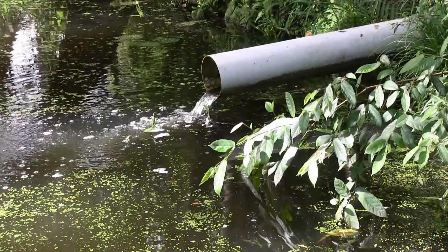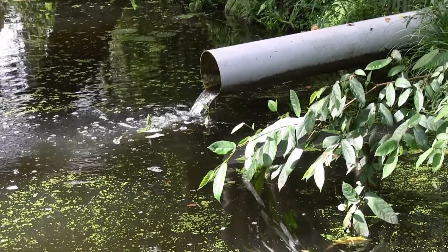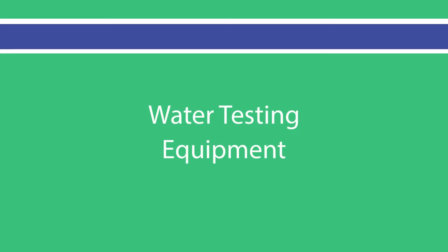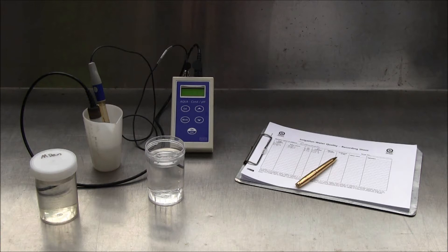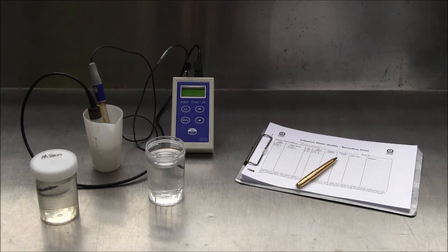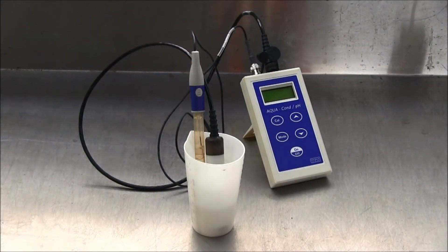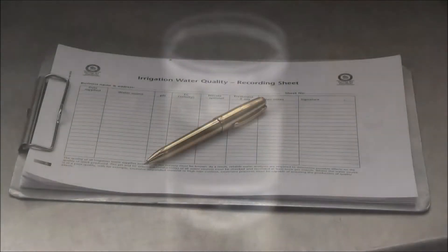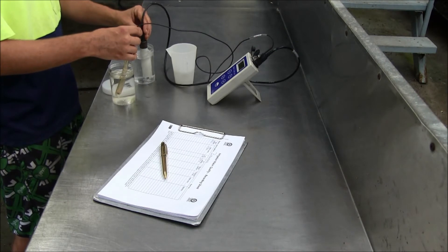This testing procedure can be used for water samples from bores, irrigation, surface and drainage waters. There is a range of equipment available for testing pH and EC. The equipment being used in the following video is a water sample, pH EC meter and probes, distilled water for rinsing, and record keeping sheets.